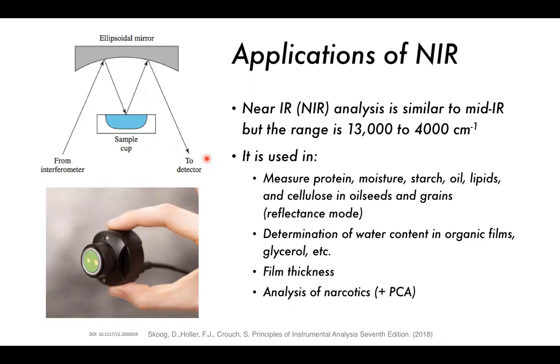Determination of water content in organic films and glycerol and things like that can be used to check film thickness, and even in the analysis of narcotics with PCA analysis. So those are some of the applications of infrared spectroscopy.